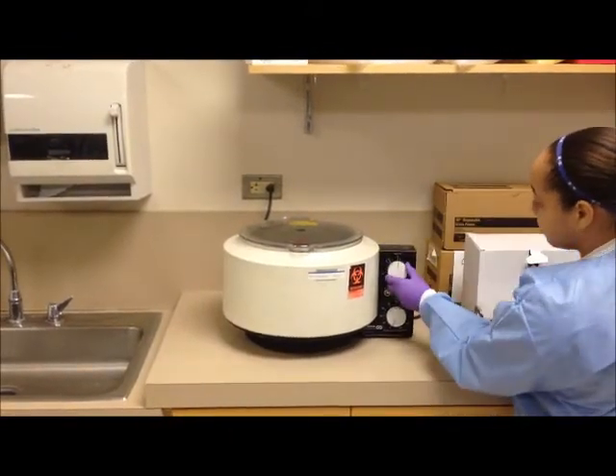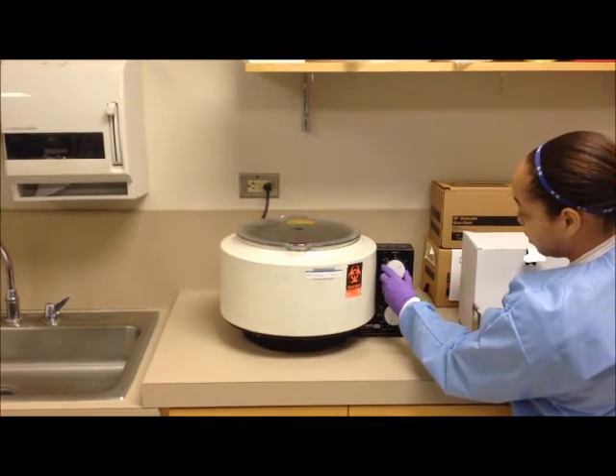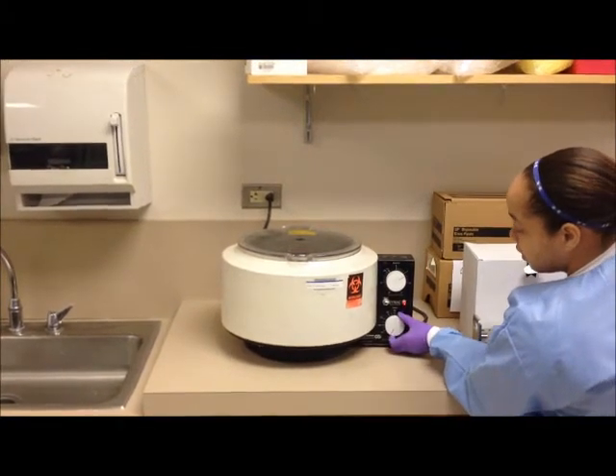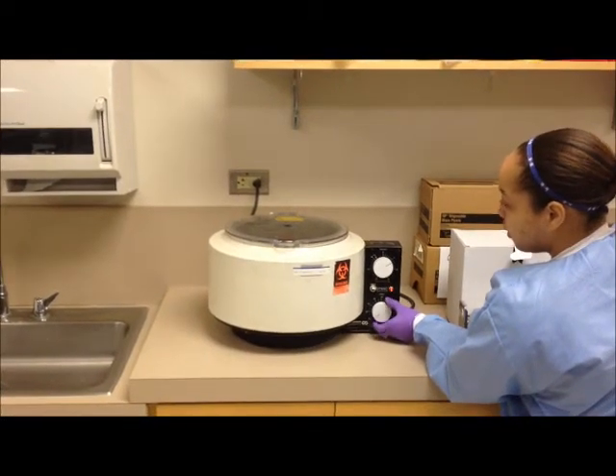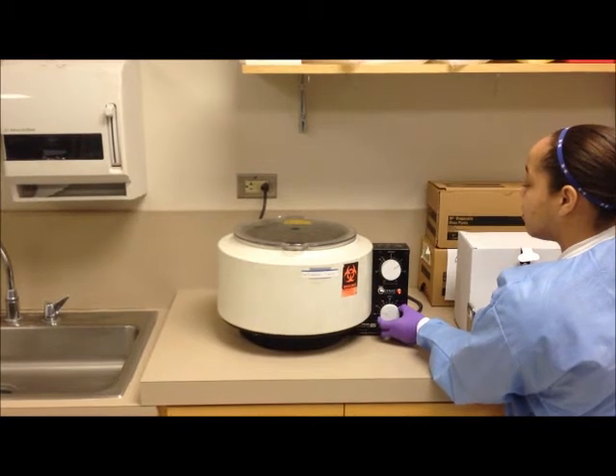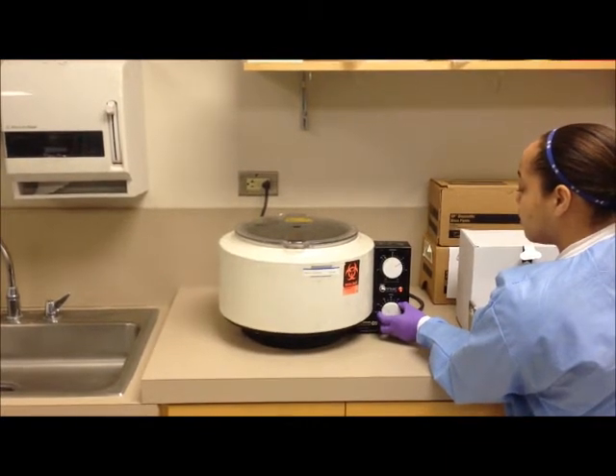Here Danielle is setting the timer. Now she's setting the speed, turning the dial slowly, and the centrifuge is starting to rotate.